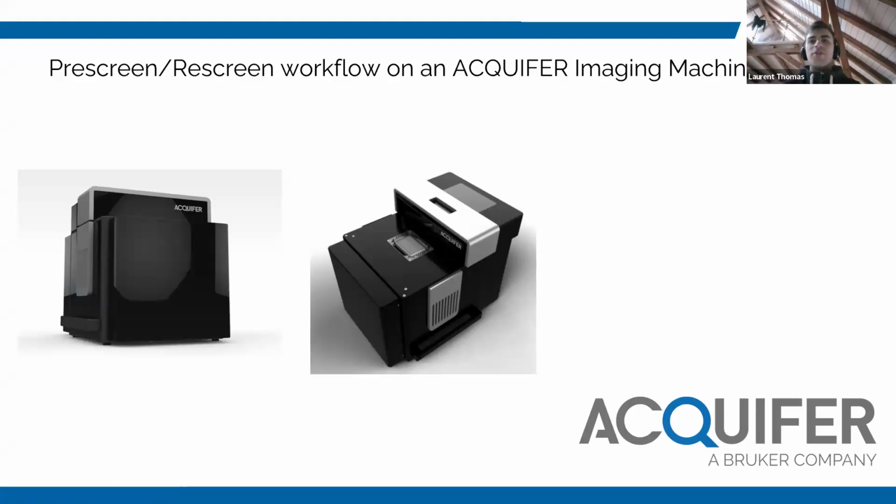Since I joined the company, actually doing my PhD thesis back in 2017, we're quite interested in feedback microscopy, automated microscopy, object detection, and so on. And so today I will talk about the Prescreen rescreen workflow that we have implemented in various ways. So this is one way we can do it on this machine.